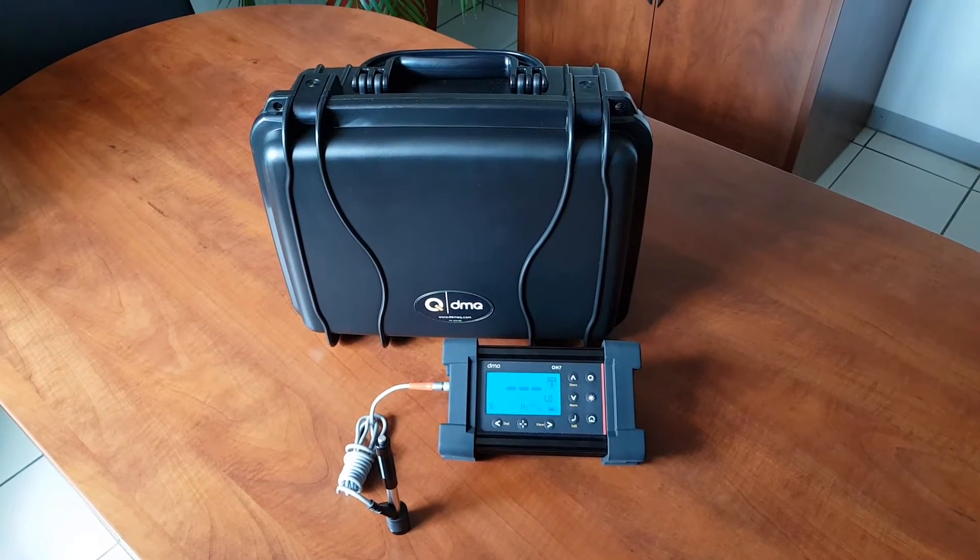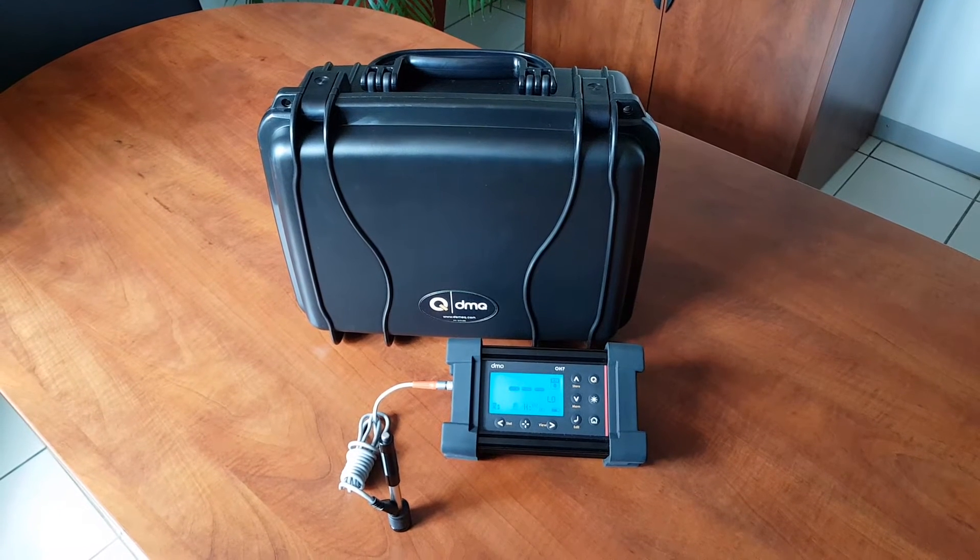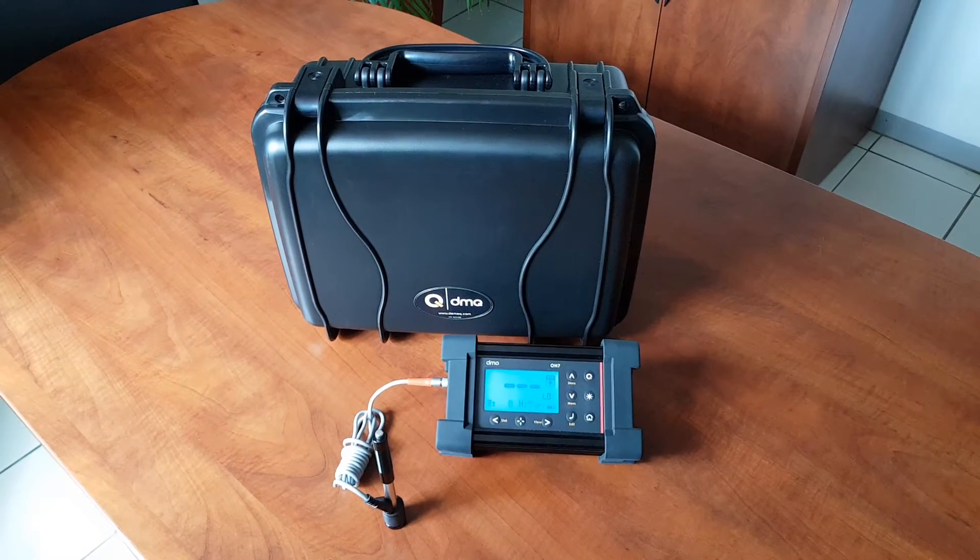Introducing the DMEC QH7L hardness tester. This rugged model complies to ASTM A956 and E140 standards.